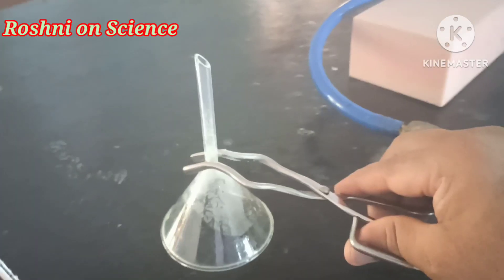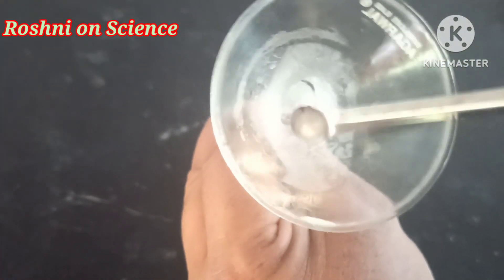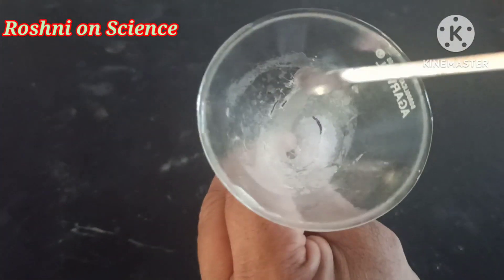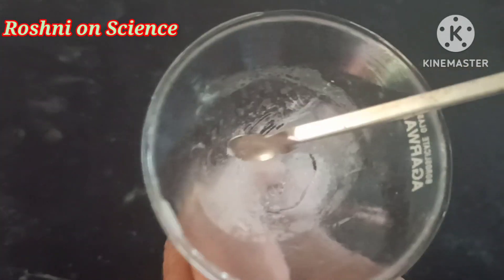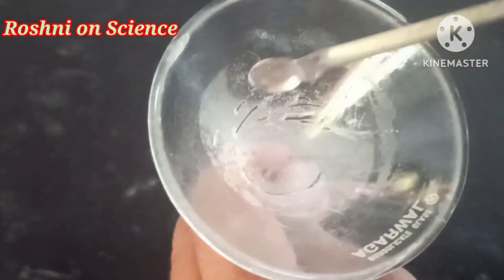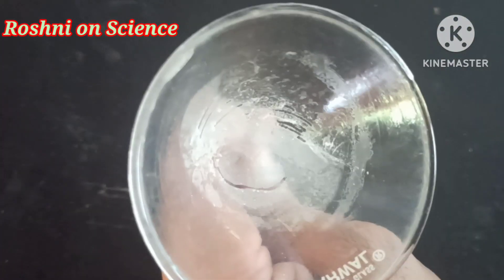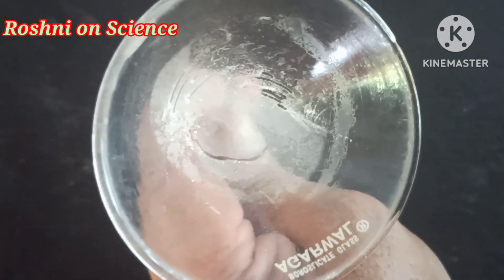When we cool the vapors of naphthalene, it gets solidified. You can notice the solidified camphor adhering to the inner wall of the funnel.